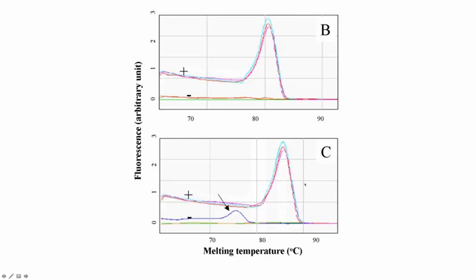So if you have some primer dimers, for example, in SYBR Green, you can actually tell that you've had non-target sequences. So if this is your target sequence right here, you can get a denaturation of your primer dimers, because they're going to have a different melting temperature, because they're either going to be shorter, they're going to be a slightly different sequence.